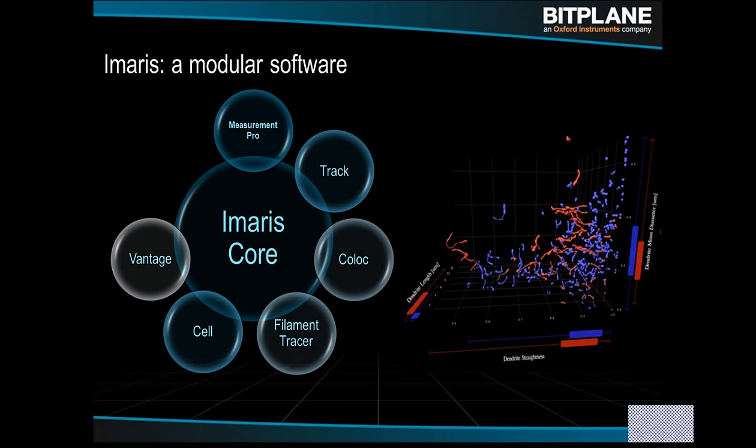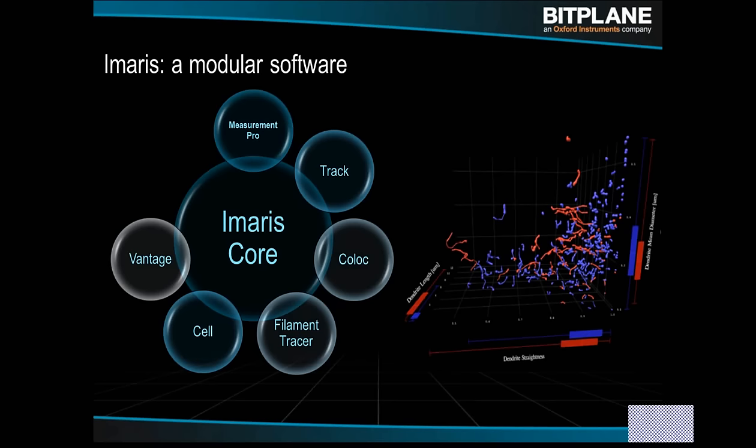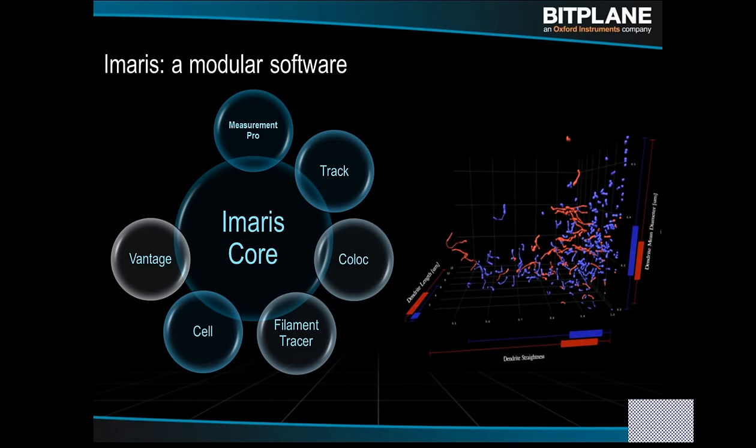That's not the only way to do it. You can do traditional point plots. You can even render volume rendered objects with a varying intensity that look a little bit more like the original fluorescence image. And if you do that, then maybe you can get some idea of how the intensity varies without plotting the intensity or something like that.